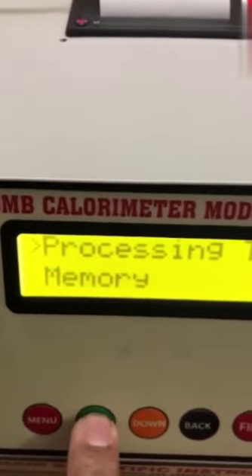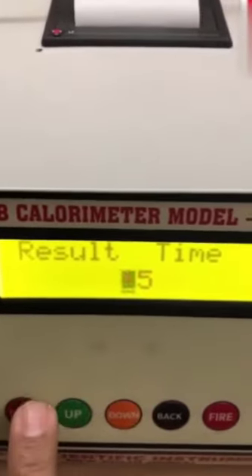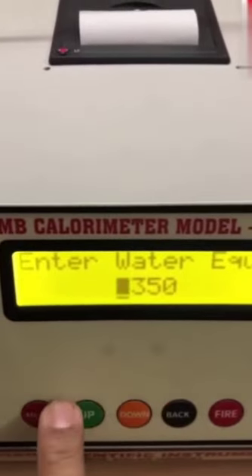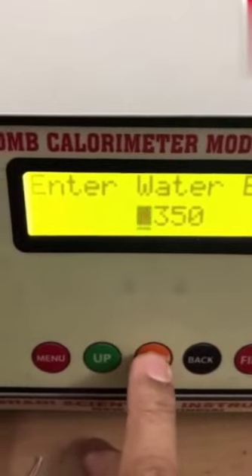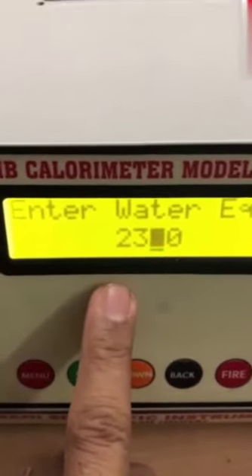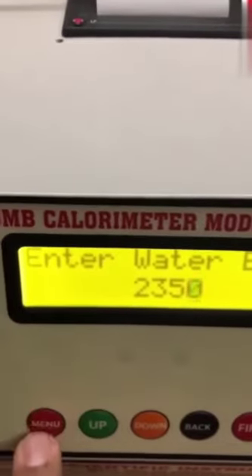Now I will show the third option: processing time. To go inside, first bring it to the first line and press the menu button. The result time is 15 — it is important, don't change it; it should always remain 15 minutes. Press menu button to go out. Now the third option is water equivalent — press menu to go inside. It is now 2350, which is the factory setting. If you want to change it, the cursor is blinking on the first digit. Press up to increase, press down to decrease. Press menu button to move to the next digit. Press back button to go back to the first digit. At present, we are keeping it 2350.